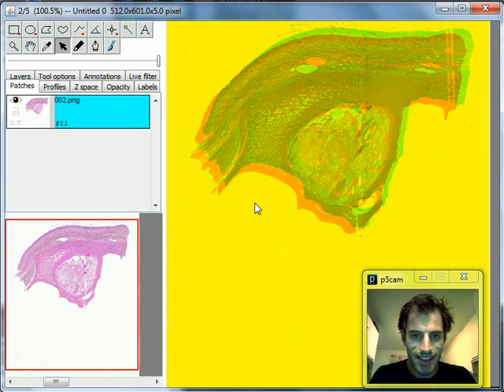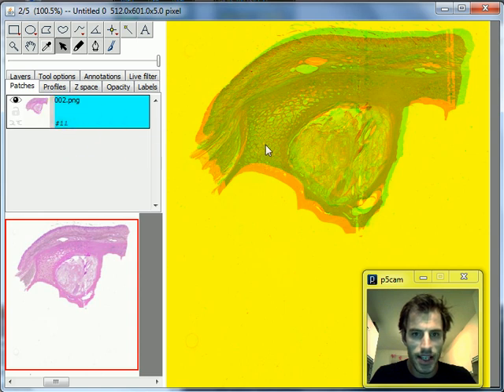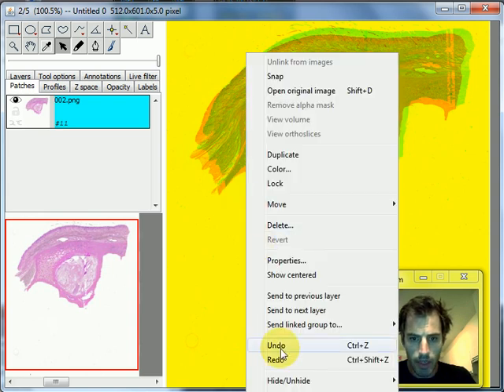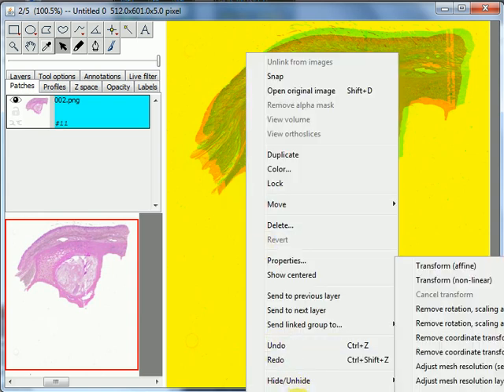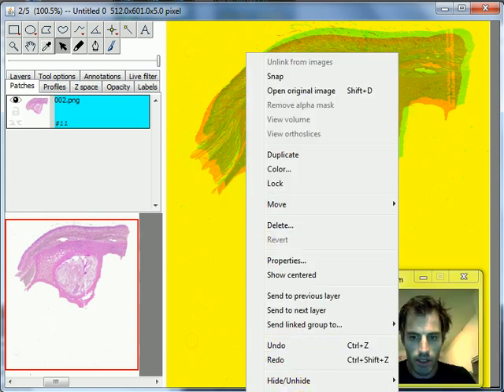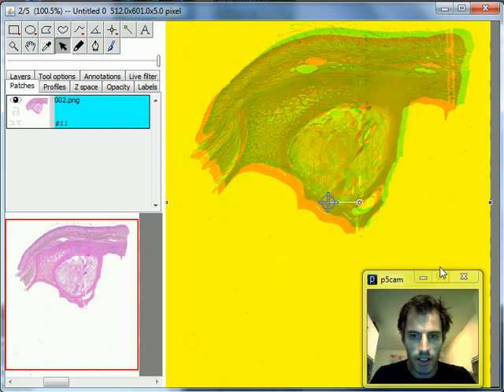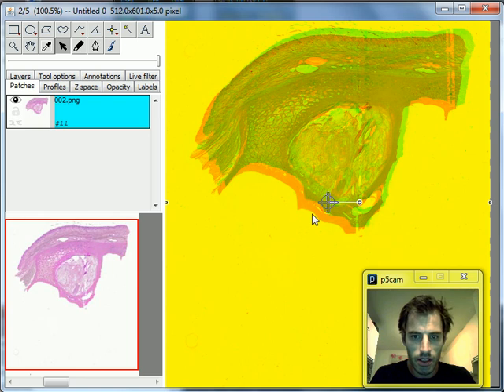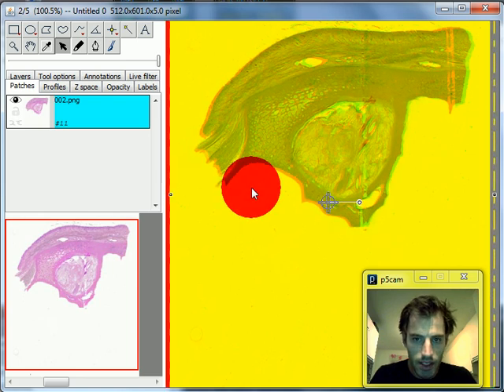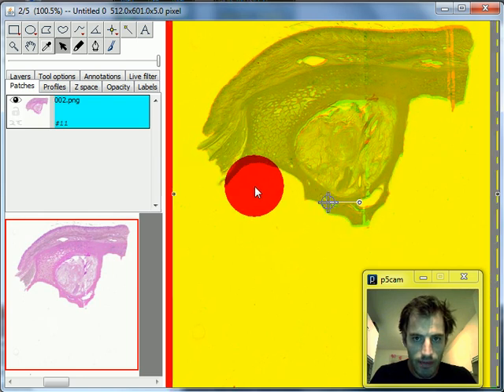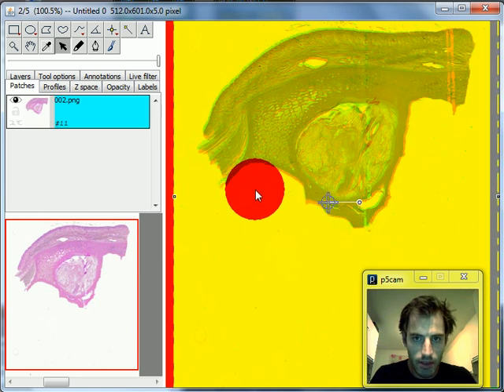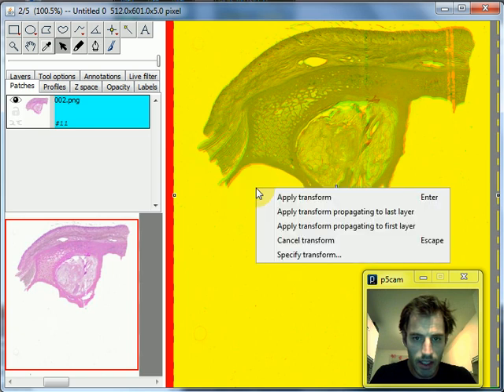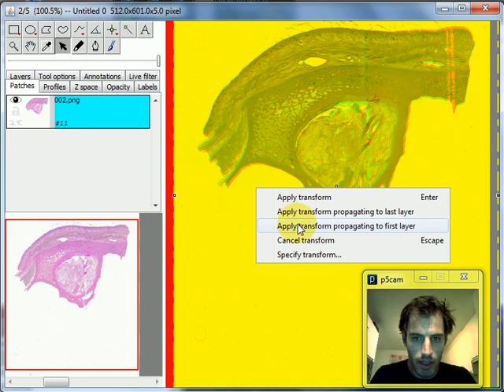I left-click on the display so it actually selects that slice on this layer, then I right-click and I pick Transform, which you can't see right now. From the transform submenu I pick Transform Affine, and now I can very easily align these two images. There we go. Right-click, and then I go Apply Transform, propagating to last layer.